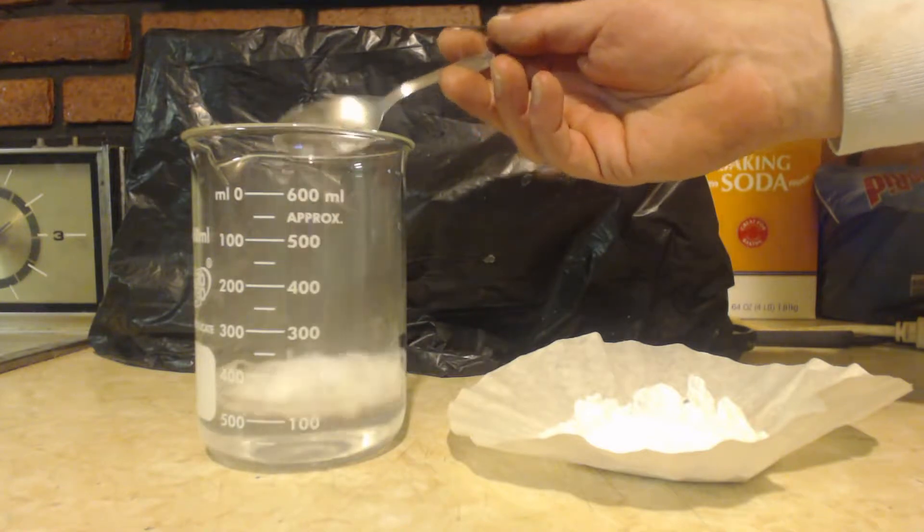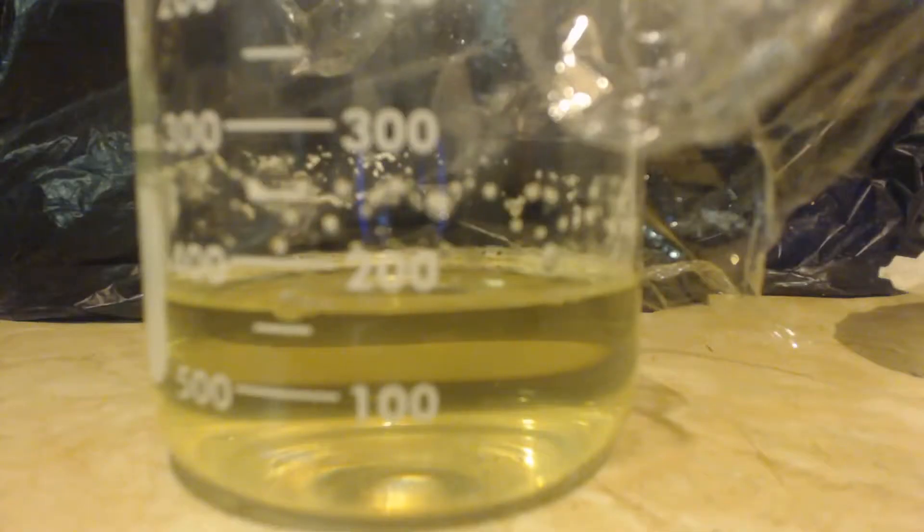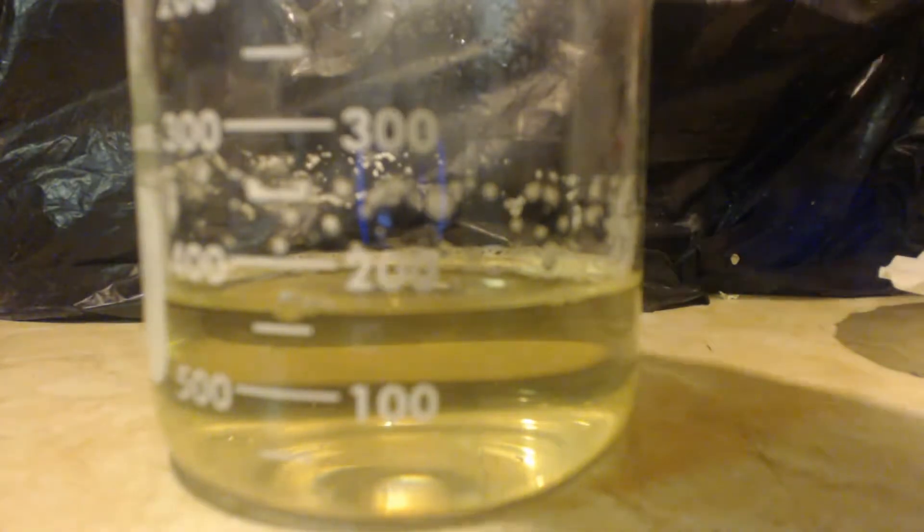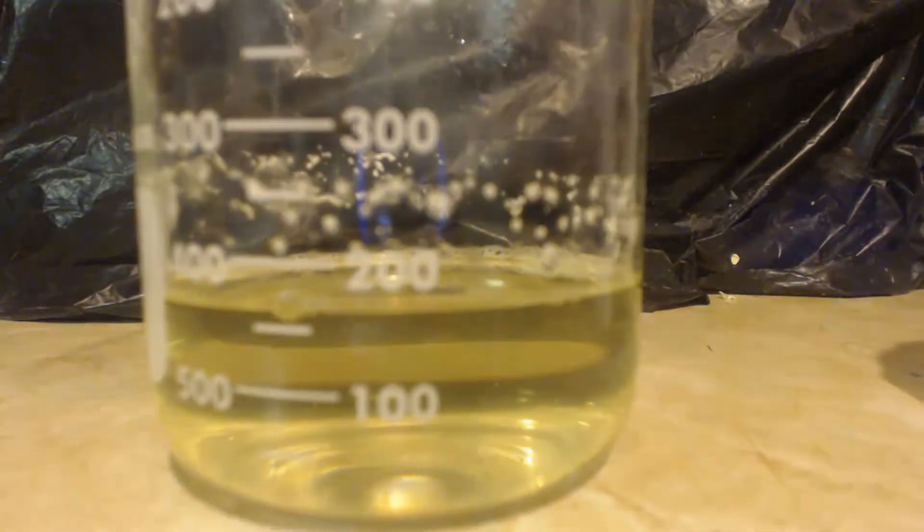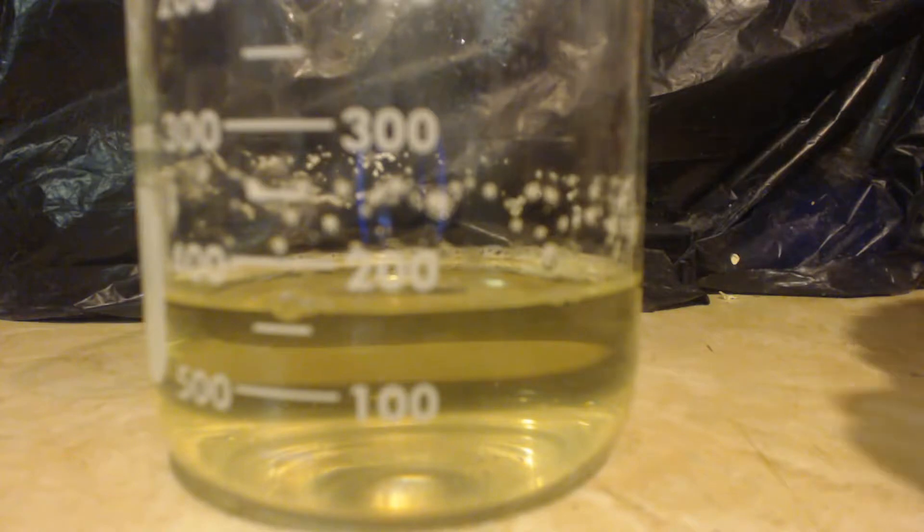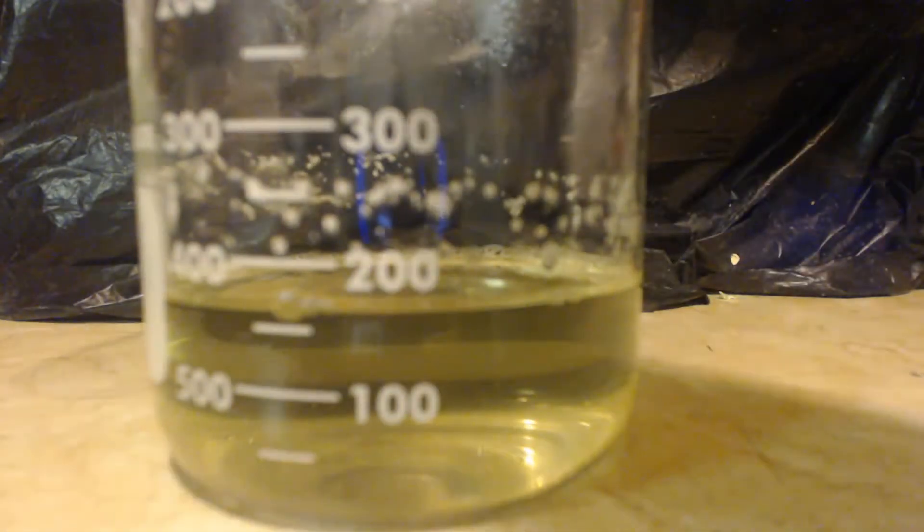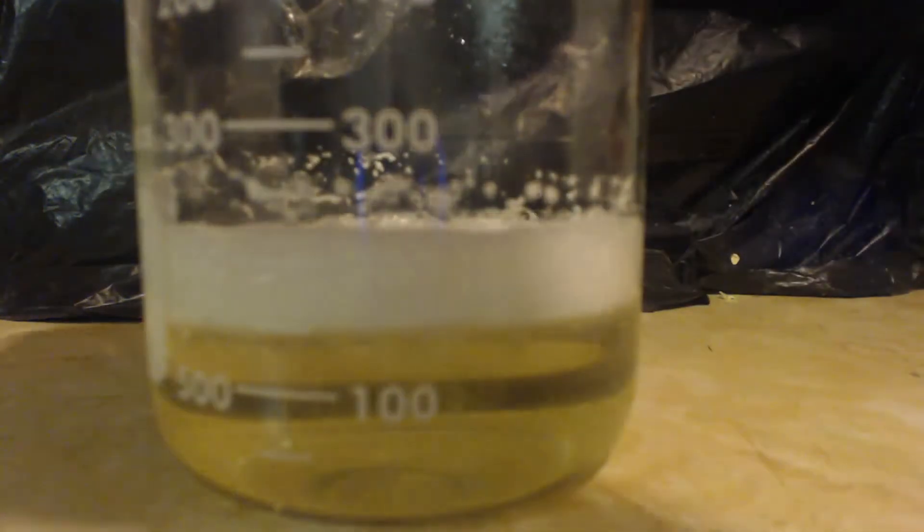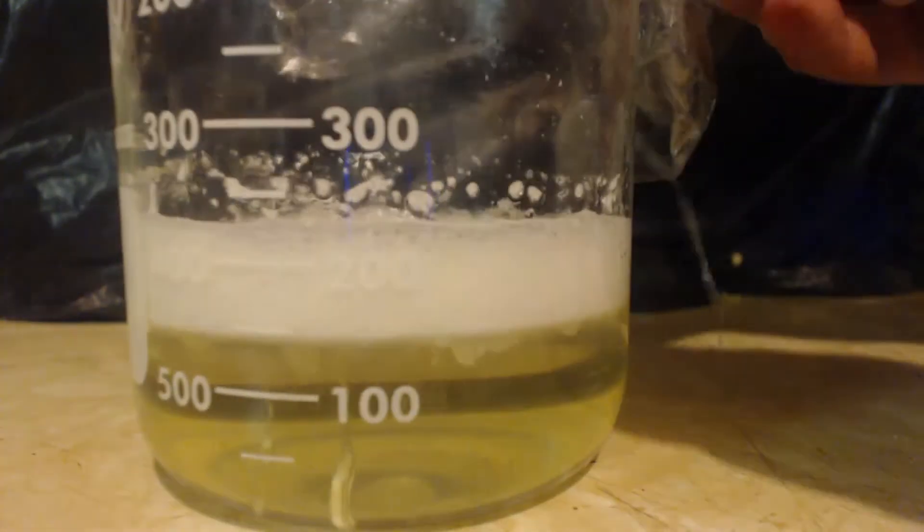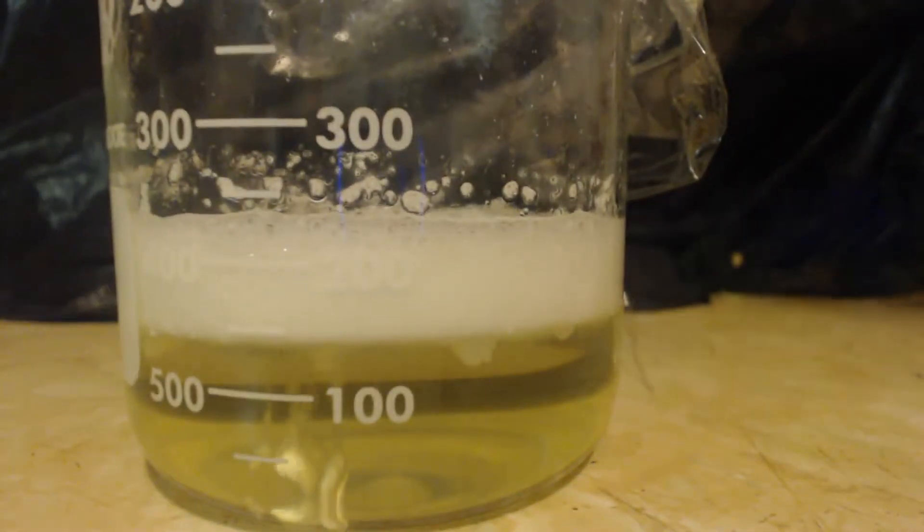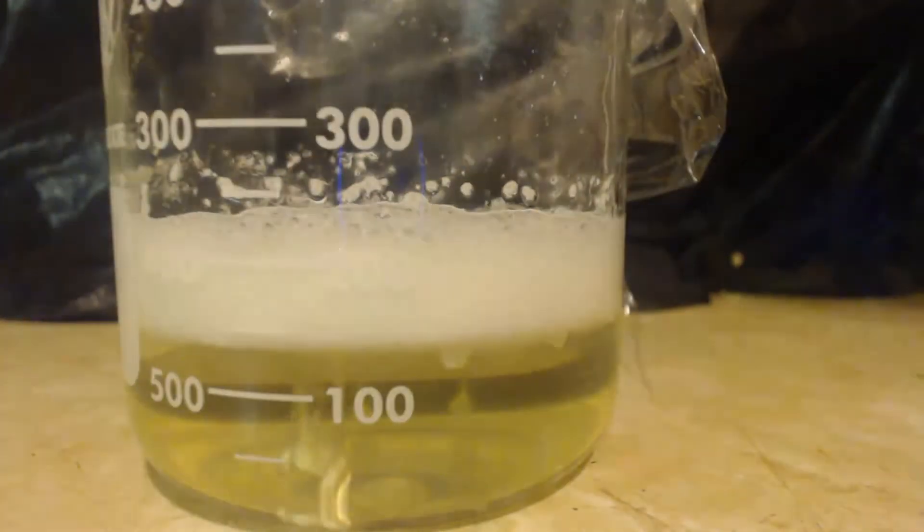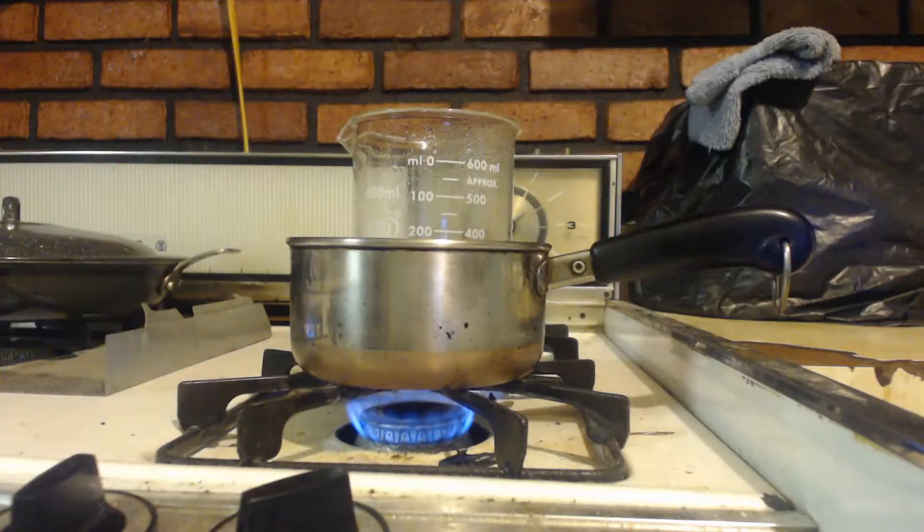I want you to notice two things. One is the color—look, it turned yellow, so there is impurity. Two is this is the last little bit of stuff I'm going to toss in. You can see it's still vigorously fizzing, so there's definitely too much HCl, which is good as we can evaporate that away.